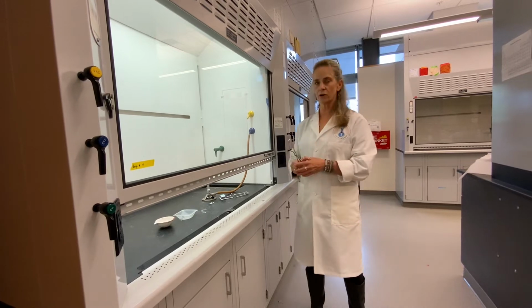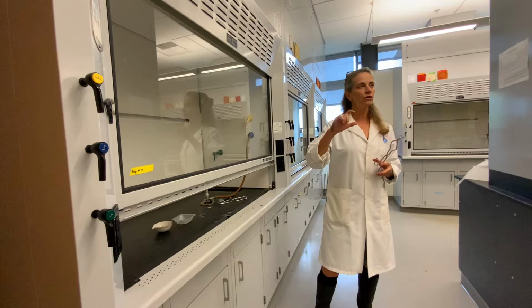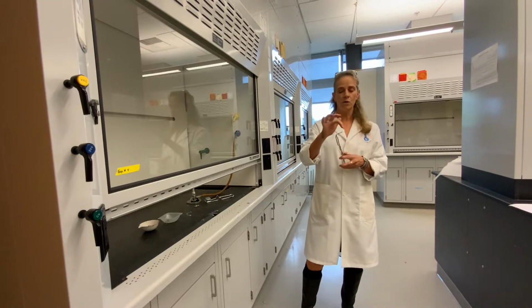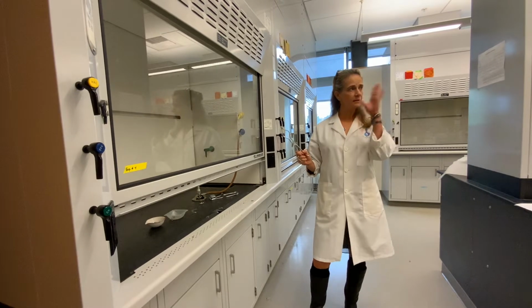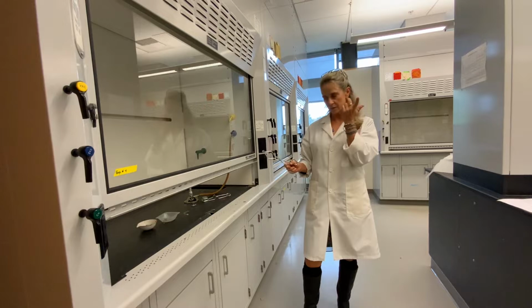And this time I encourage you guys to note in the flame there'll be an inner blue flame and then an outer lighter flame. At the top of the inner blue flame, that's the hottest part of the fire. If you hold that in there, that'll go fast. We've talked about this in class a little bit. So this one, if you're really sensitive to light, you'll want to use your averted vision, meaning look at it at the side. It's going to be very bright.